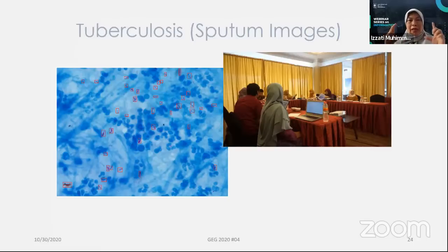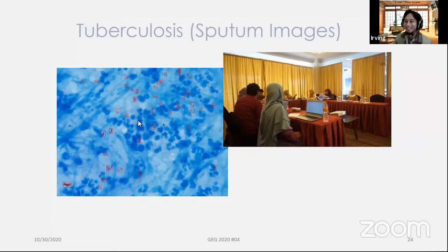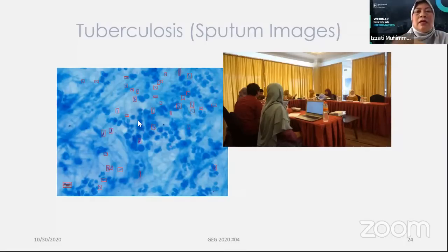That is like the full view of the microscope, but you slightly move the slide. So you take the picture of one and you move slightly to take the picture of the second image across that. If I draw what I meant, here, under the microscope, you may take that one.